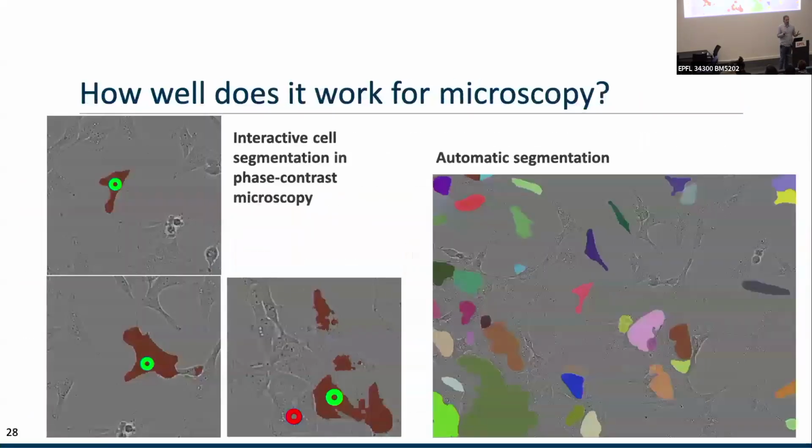Okay, and now this brings us to our work, which, when this was published, we became very interested in, because this now maybe promises to relieve this burden of every time having to train a new model with painfully annotated objects. Rather, we could maybe say, let's use Segment Anything. Can we solve a lot of these segmentation tasks in microscopy with it?